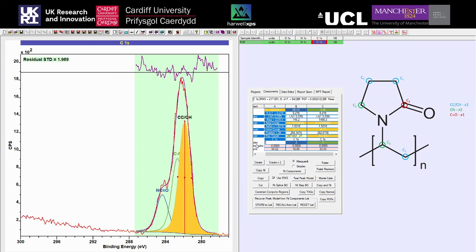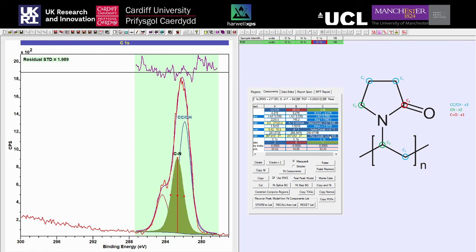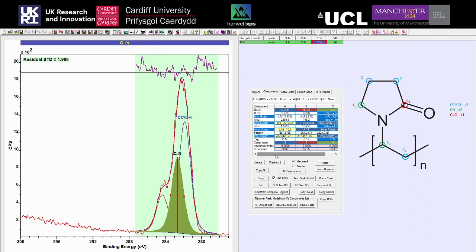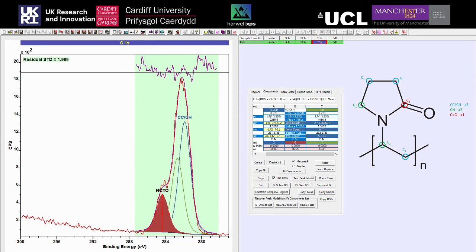We can match the colors up so our C-C/C-H is blue, our C-N is green, and the carbonyl is red. The component tool is something we'll come onto later - it's very useful, particularly when we start looking at more complex systems such as multiplets and doublets, but it can also be a nice way to separate out your peaks and be sure that you are assigning everything correctly.